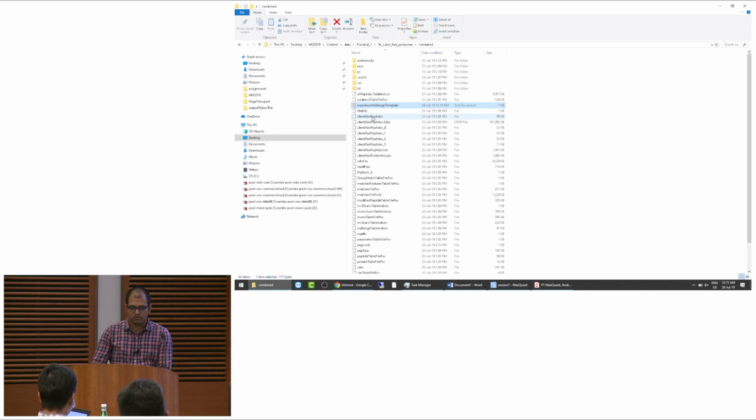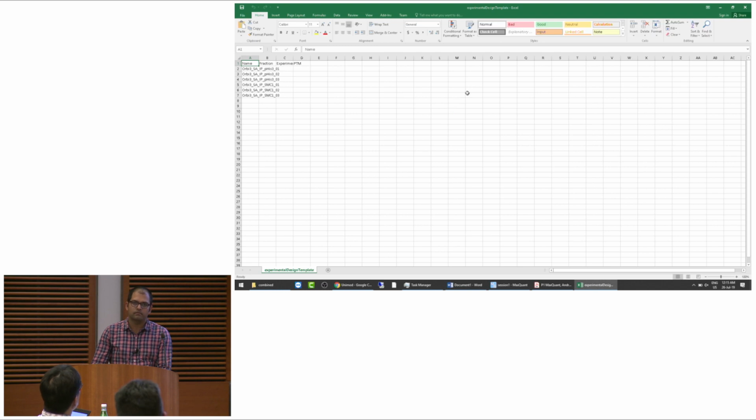So along the same lines, if you have, say, 7 samples with triplicates, so 21 data files, and you've named them, just put rep1, rep2, rep3. So for set experiment, you would want to take those 21 and name them, say, control. And then if you have another 10 or 12 in triplicate, that would be a separate set, and you would say set experiment and name it experimental or something else.